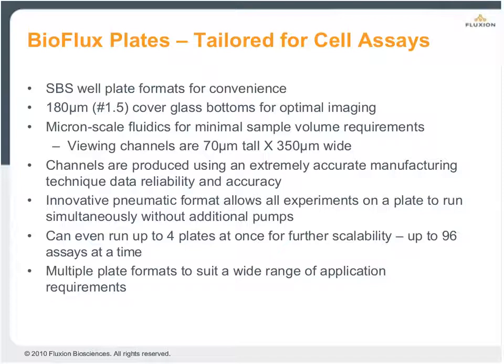All the channels are extremely close in size to each other. I consider them identical. And the way the hardware is designed with the interface, the entire experiment is contained within the plate. There's no fluid that's going to leave the plate and go into the tubing, which is traditional in a flow system.